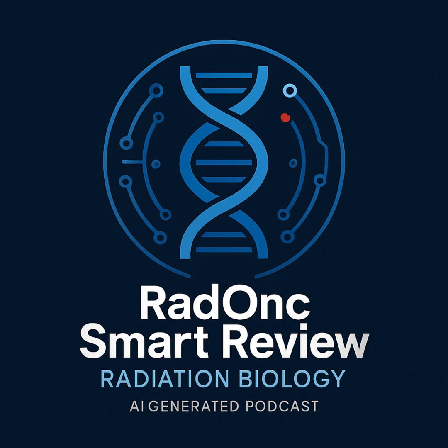Useful. Any others? One more key one. The in vivo, in vitro assay, the name kind of gives it away. Hybrid approach. Yeah, it combines the best of both worlds. You treat the tumor in vivo, inside the animal, maybe irradiated right there in the mouse. So it experiences the real tumor microenvironment, hypoxia, everything. Precisely. Then, after the treatment, you excise the tumor, break it down into single cells. And plate those cells in vitro for a standard clonogenic assay, just like we discussed at the start. Exactly. So you get the realistic in vivo treatment conditions combined with the precise quantitative readout of the in vitro colony counting. Very powerful technique.